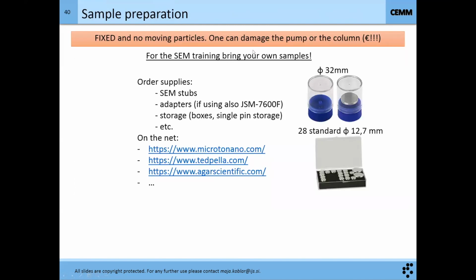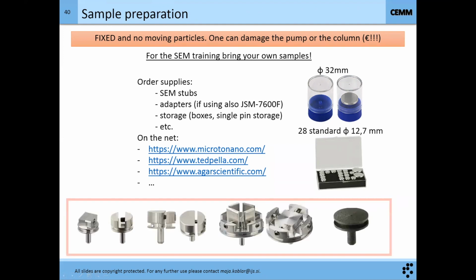So the samples have to be fixed, no moving parts. You can damage the pump or the column. There are some adapters that you have to buy. They're the same as on the FIB or on the various.